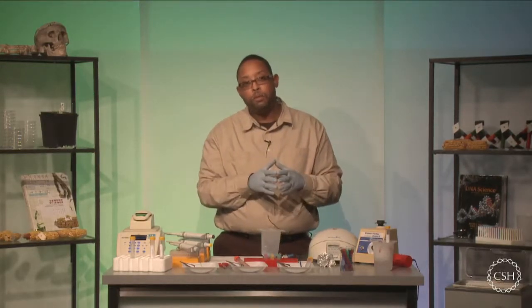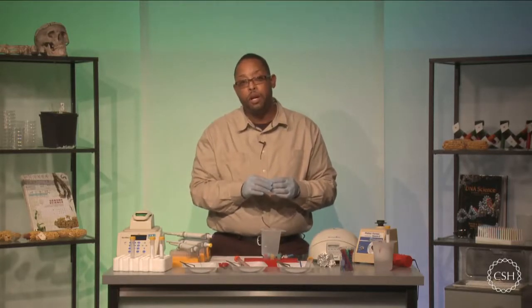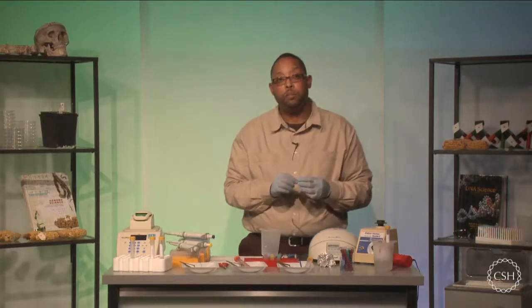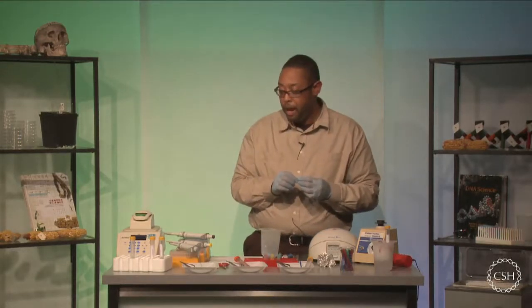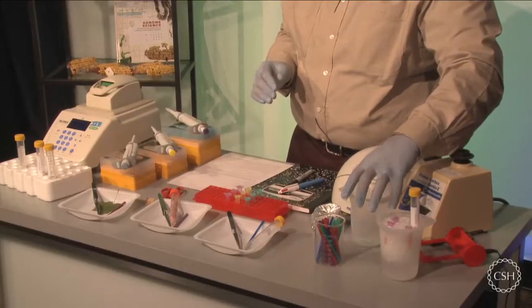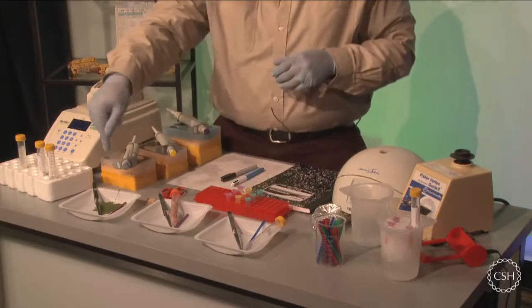If you leave your samples on ice, it's not going to make that much of a deal, or you can even leave them at room temperature. But please allow for the temperatures to get met before you do the main incubations. Okay? Now, what I want to do here is get started. So I'm going to put a garbage beaker here to my left because I will need to have some disposal area. So the first thing I'm going to go for is the plant.